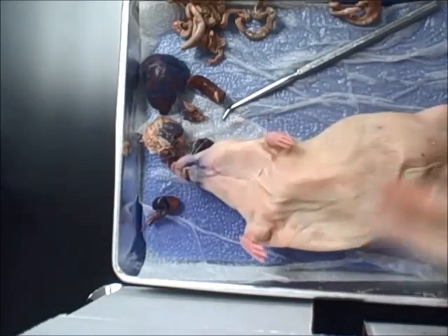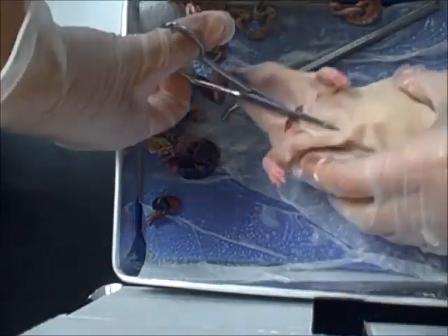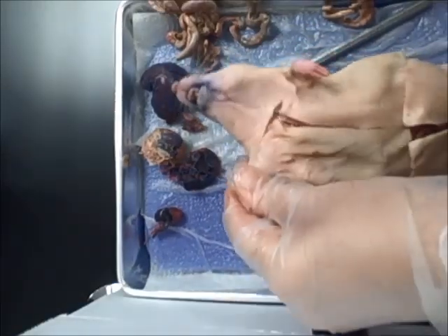Female rat is going to look very much the same with the exception of the reproductive organs. Let me get her cut open. Drain the preservative out.